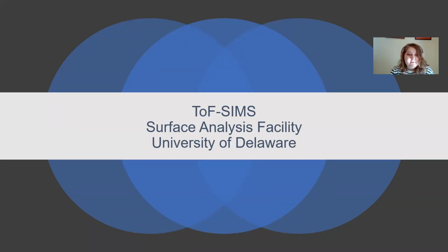I'm with the ToF group at the University of Delaware, and I'm going to talk briefly about the ToF SIMS instrument that we have in the surface analysis facility.